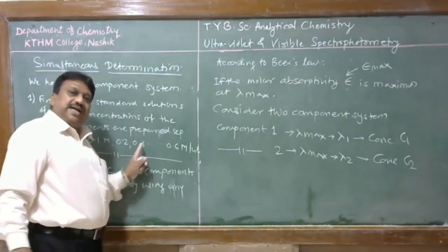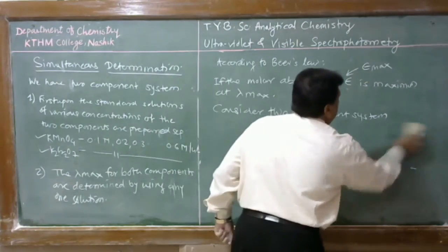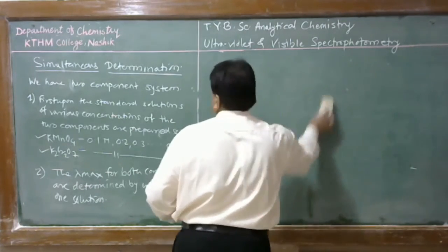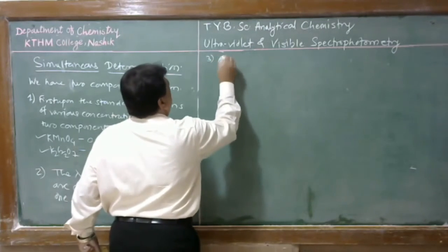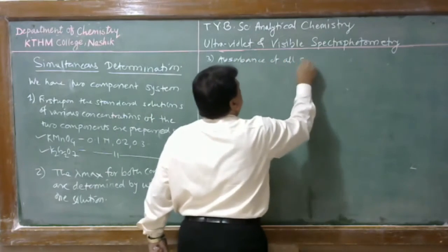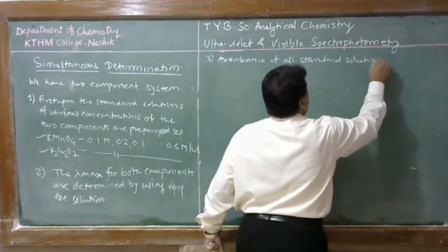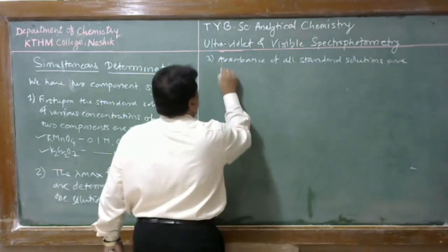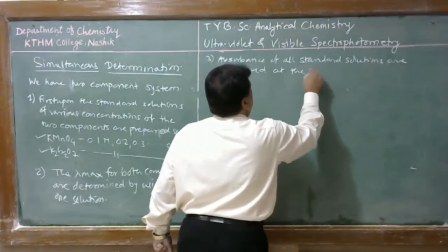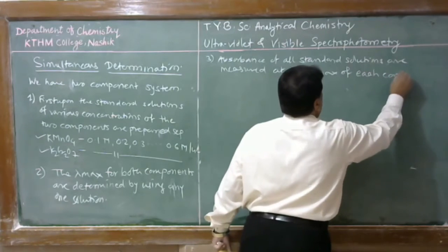Therefore, any one solution can be selected for determination of lambda max. When we determine the lambda max of each component, then the absorbance of all standard solutions are measured at the lambda max of each component.